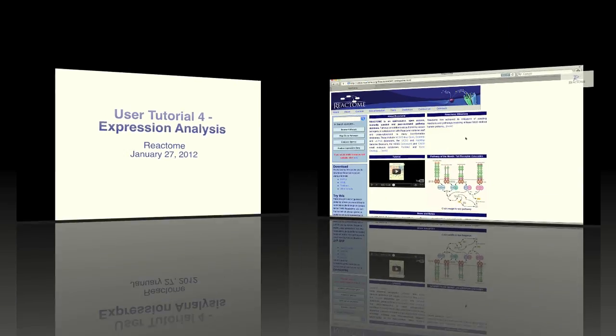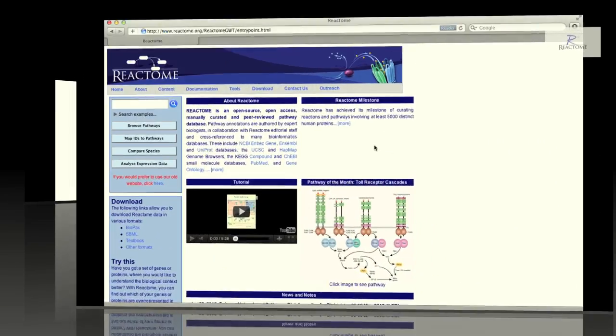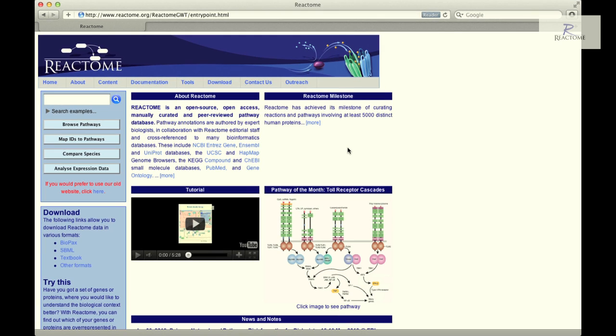This webinar will show how the Reactome Expression Analysis tool can be used to overlay expression data onto Reactome pathway diagrams.